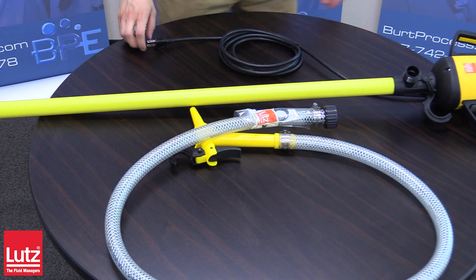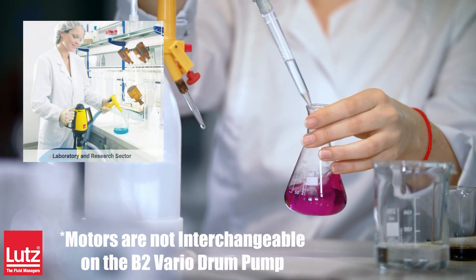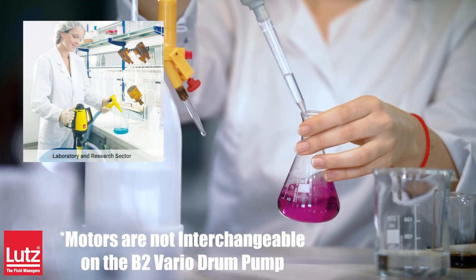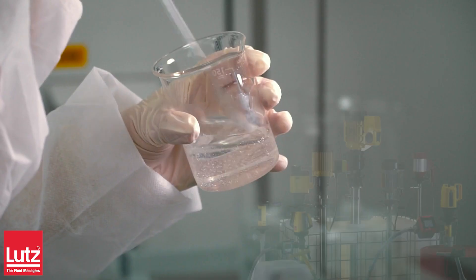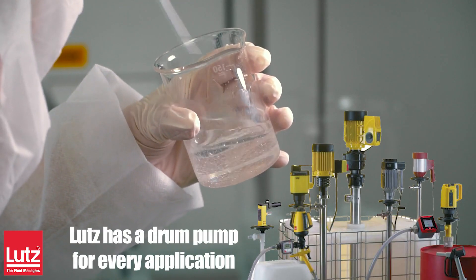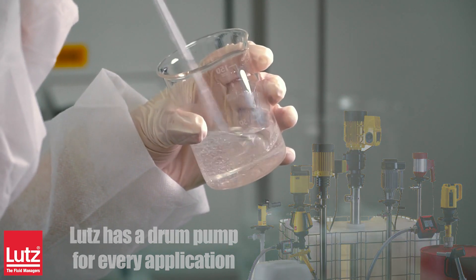Lutz Drum and Container Pump Series are versatile, application oriented, high quality, easy to use, and have interchangeable pump tubes. These pumps are light duty and designed for only modestly viscous chemicals. Lutz manufactures pump sets designed to handle much higher viscosities and offer drum pumps that can pump up to 125,000 centipoise.